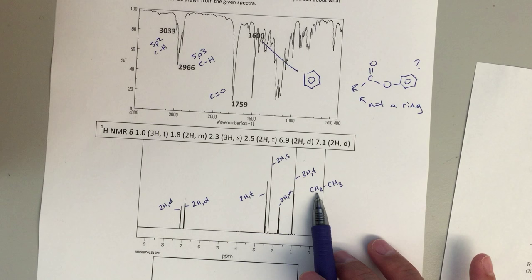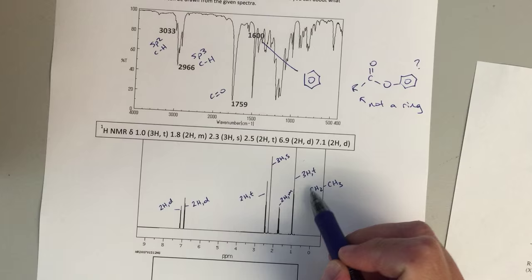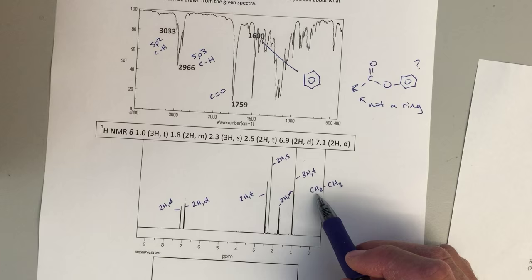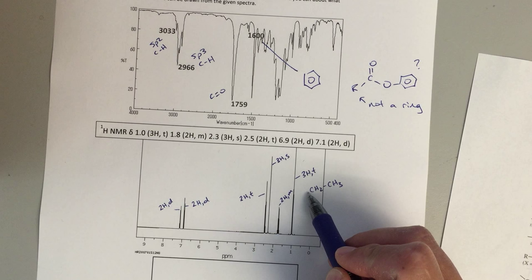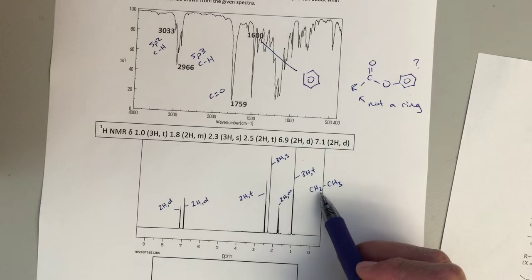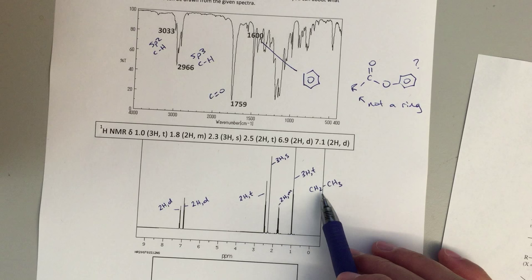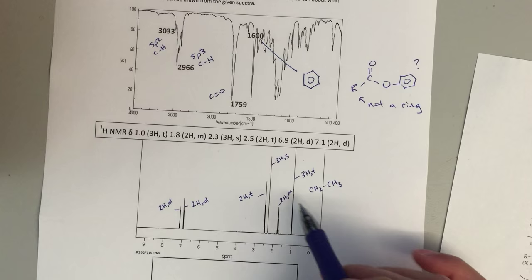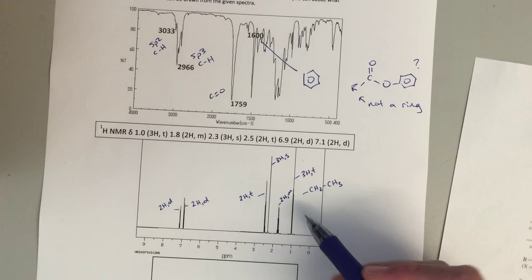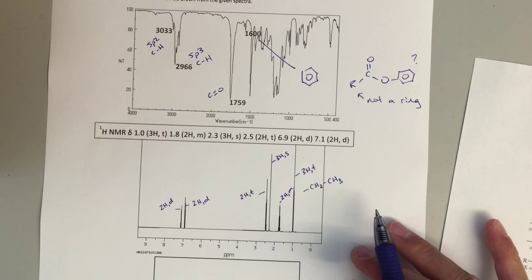For this CH2, I think if this was linked to my carbonyl carbon, then I would expect to see some sort of 2 high quadruplet. I don't see that. But this CH2 is probably linked to something else, and then it's this multiplet here, because I've got to have a 2 high something. It's not going to be this 2 high triplet because this would be a quadruplet at least. So this methylene is probably this peak here, and then that's probably linked to something else. So there's going to be some other CH2 or something else here that I'll have to deal with. So far that's pretty good.